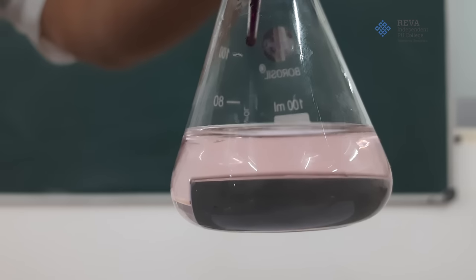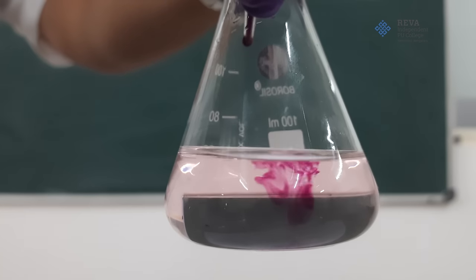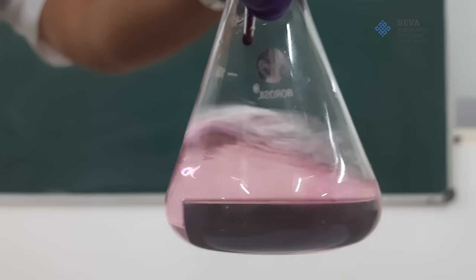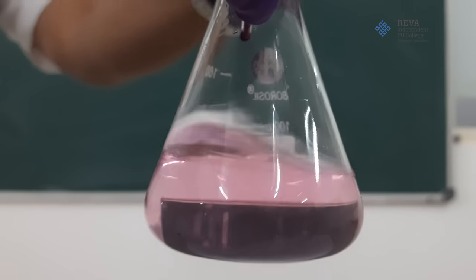In this titration, potassium permanganate solution of unknown concentration is titrated against a standard solution of ferrous ammonium sulphate, which is 0.1 molar.